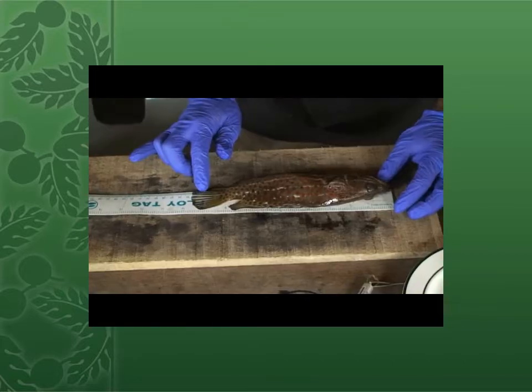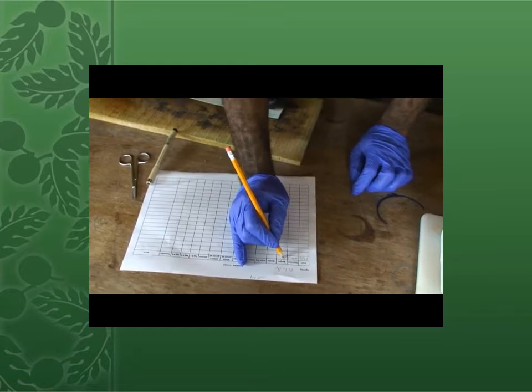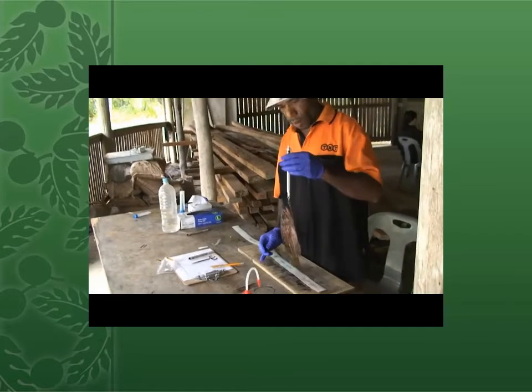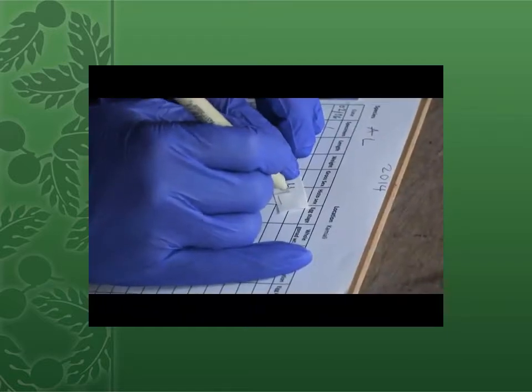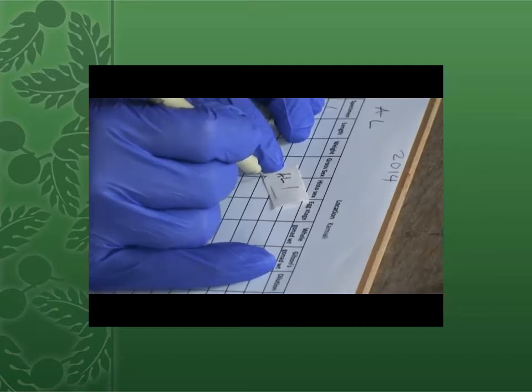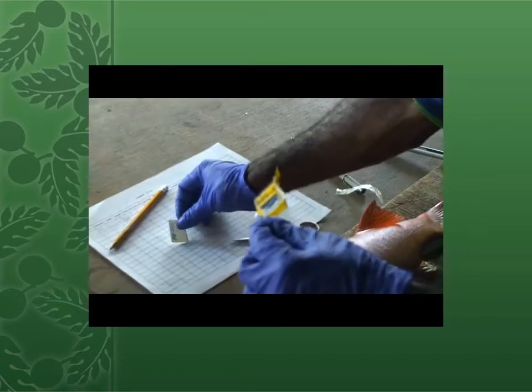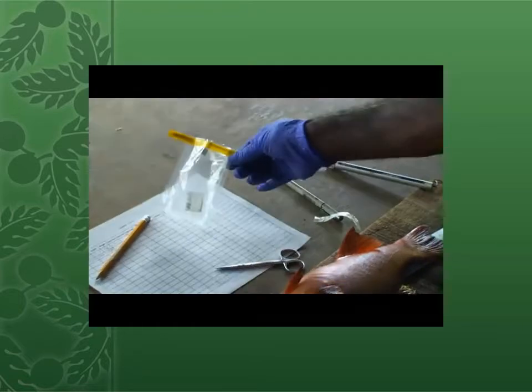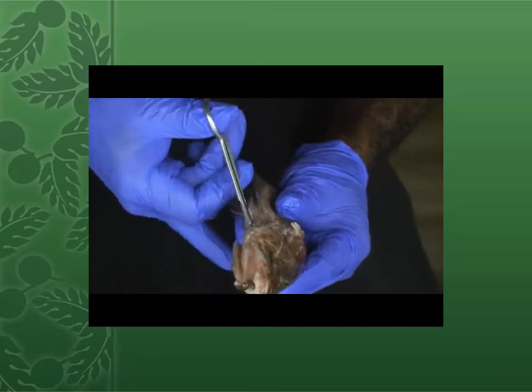Record the date, measure the specimen, record its length, weigh the specimen, and record its weight. Record the specimen number on a tag consisting of a large part and a small part. Put that tag into a specimen bag and then remove the gonads from your specimen.